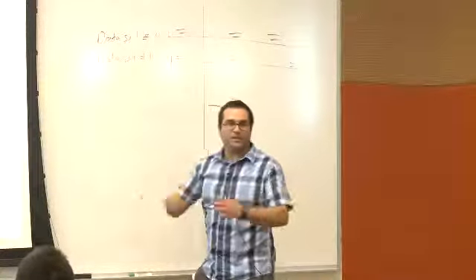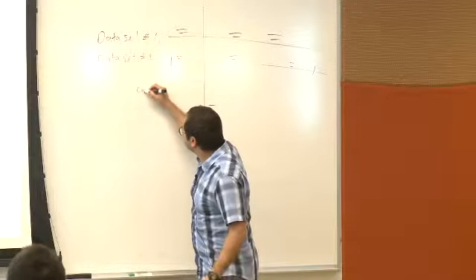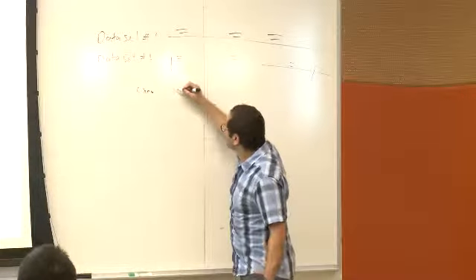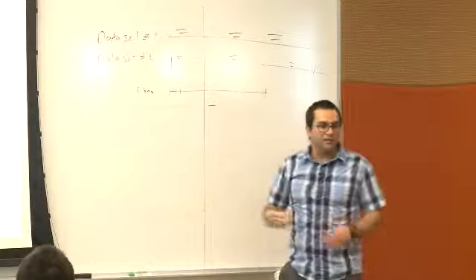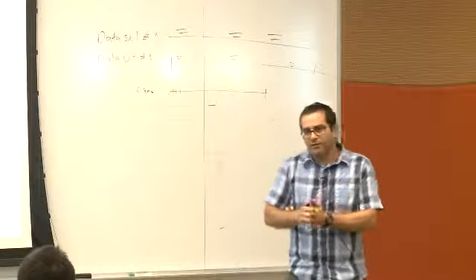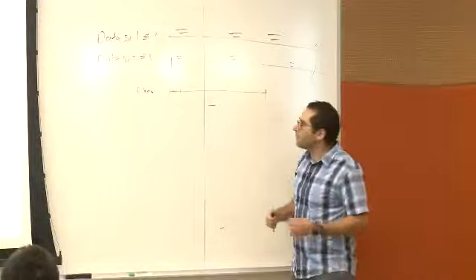So instead of looking at the entire genome at once, we look at each of the chromosomes. And within each chromosome, we take, for instance, 1 kb or 5 kb or 10 kb bins, but much smaller than the entire chromosome, or of course much smaller than the entire genome.